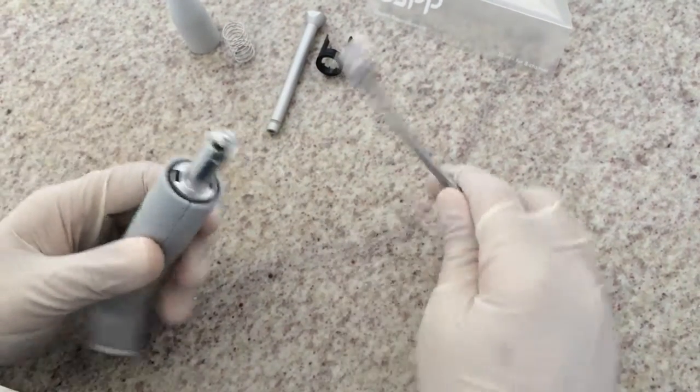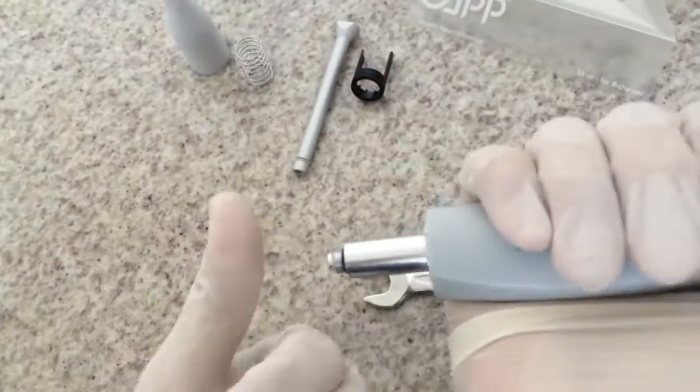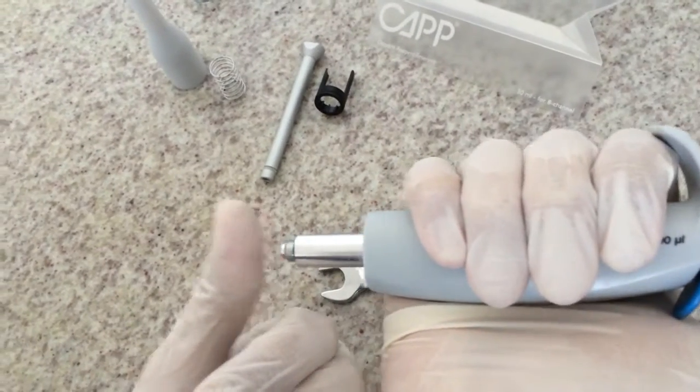Always tighten it gently. And once you finish this part of the assembly, you can put the volume controller back and make sure that there is a tight seal.